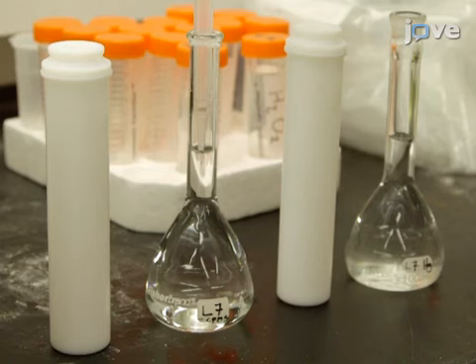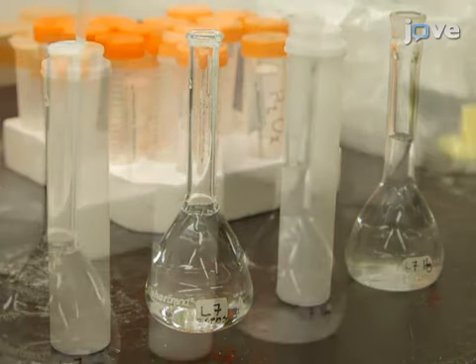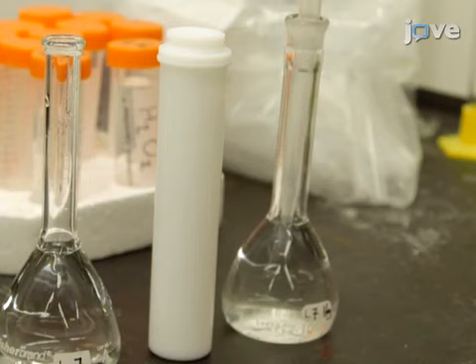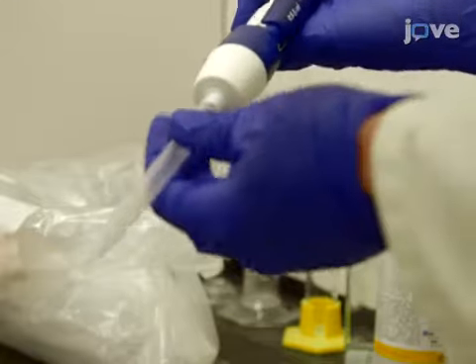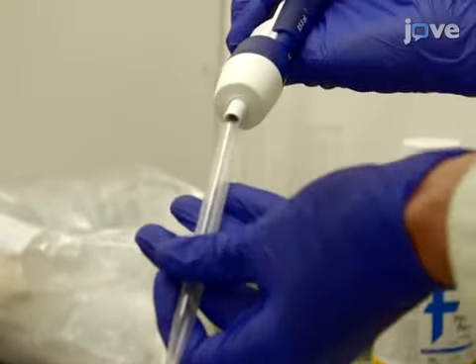For quality control, prepare 2 laboratory-fortified blank or LFB vials containing either 5 milliliters of level 7 ICP-MS standard or 5 milliliters of level 7 mercury cold vapor atomic absorption spectrophotometry, or CVAAS, standard. Leave another vial empty to be used as the laboratory reagent blank or LRB.